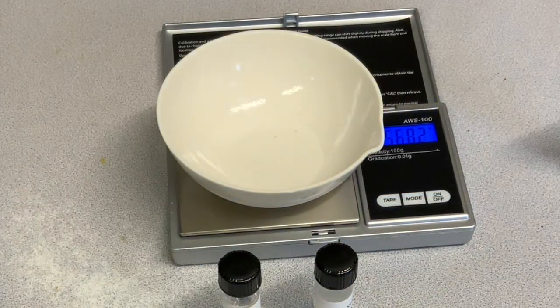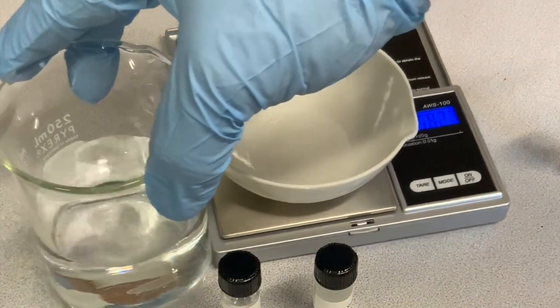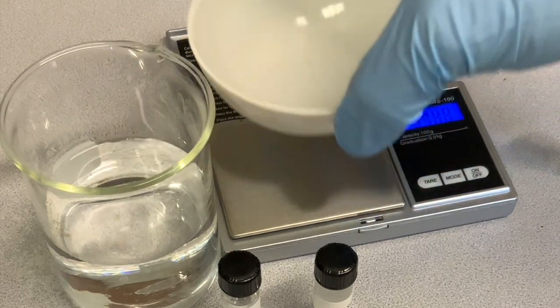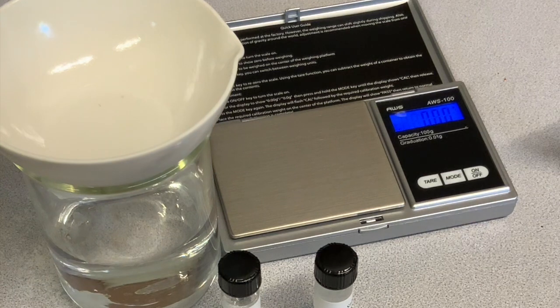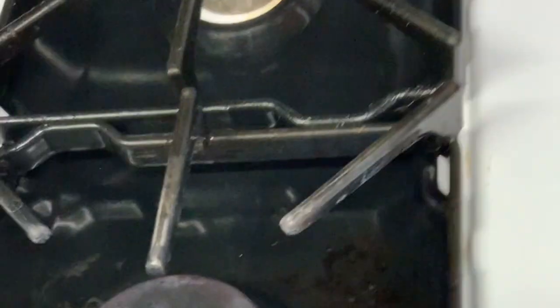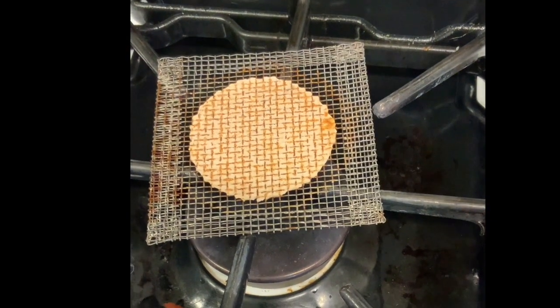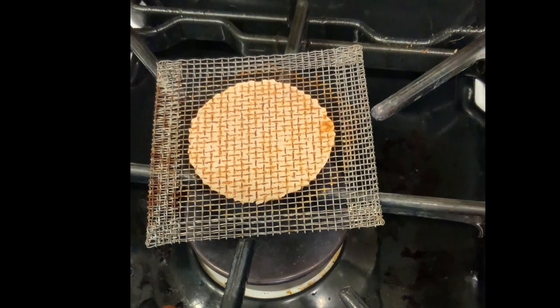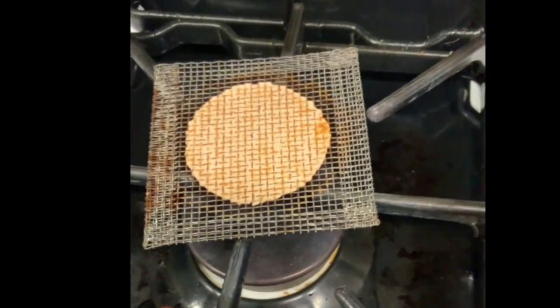The next thing I'm going to do is take my beaker of water and put my evaporating dish on top of my beaker of water, and then I'm going to boil the water. You could use your alcohol burner, or in my case, I'm going to use my stove top. And then I'm going to turn on the burner.